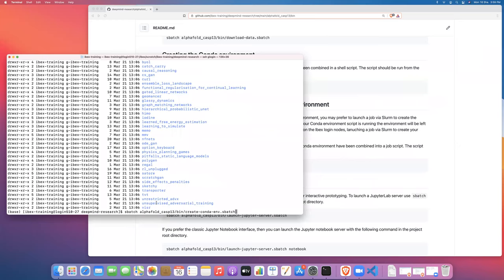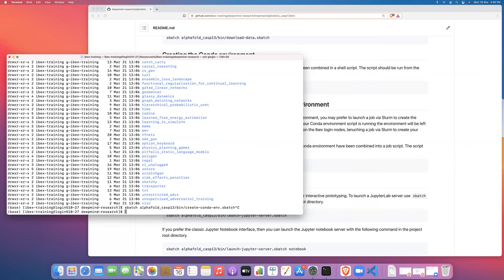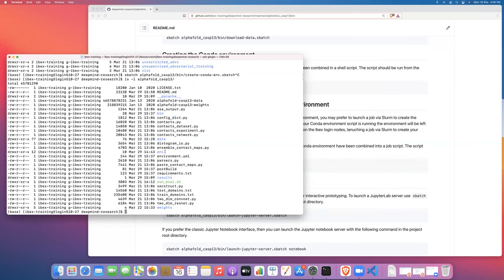Now I've actually already run this script, and so I'm not going to do it here. It takes about 30 minutes or so to run the script and install the code. But once you run it, you should see that in the AlphaFold directory you should see an env directory. So this is the conda environment that would have been created by launching that batch job.